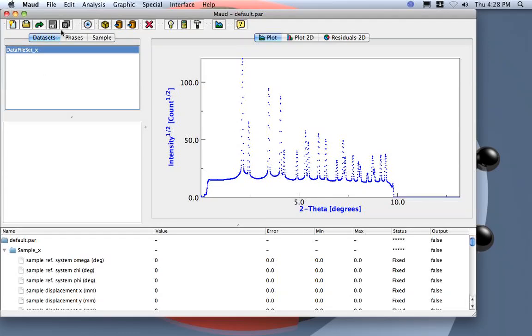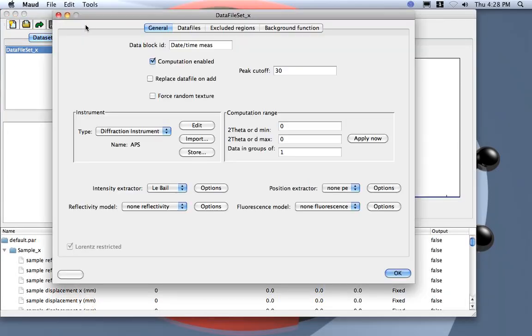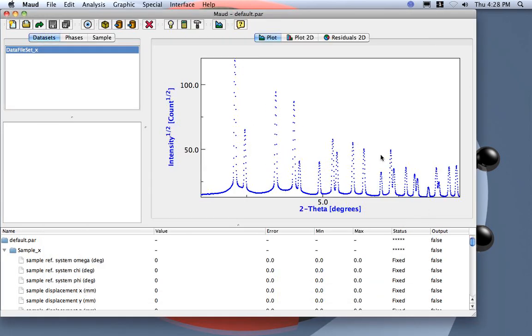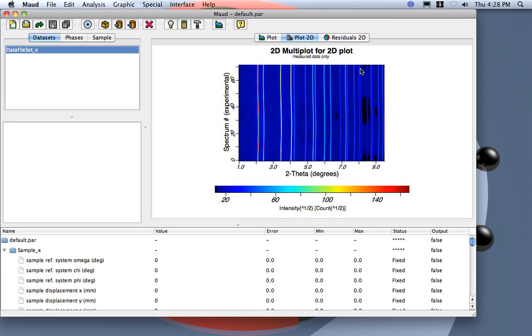I select the dataset, go to Edit, and specify the range. I save the range from 1 to 9.5.